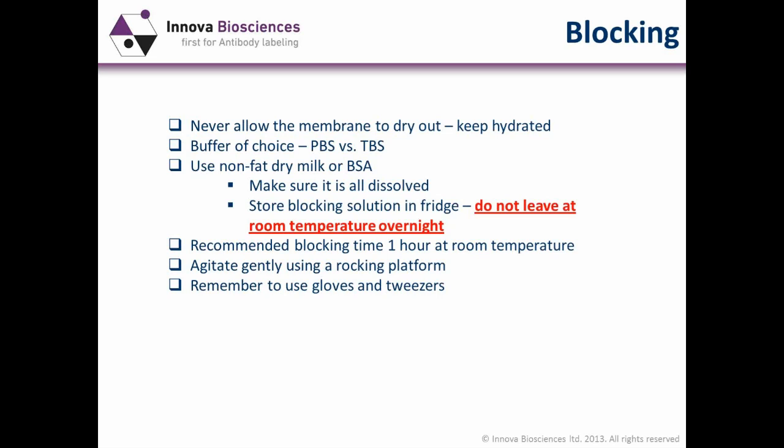For a 10 by 10 centimeter blot, for the whole system, including primaries, secondaries, wash steps and blocking, I would use somewhere between 1 to 2 liters of solution. That's how much I would use to make sure I ended up generating some really nice blots.